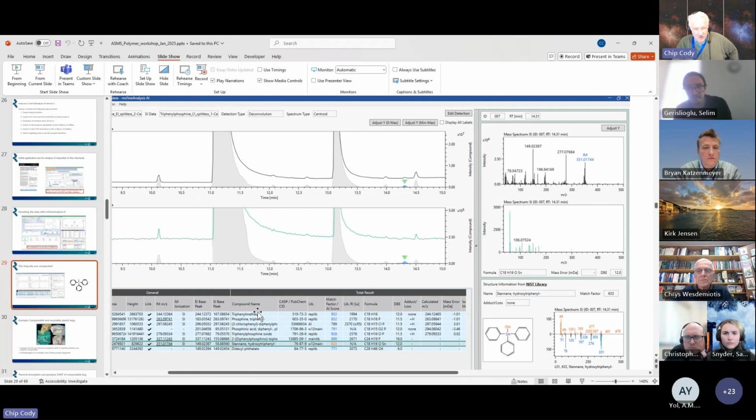For things that are in the database, it will prioritize that experimental database data. But for things that aren't in the database, if you have an elemental composition, it will go ahead and carry out the AI data analysis. Does that answer the question?